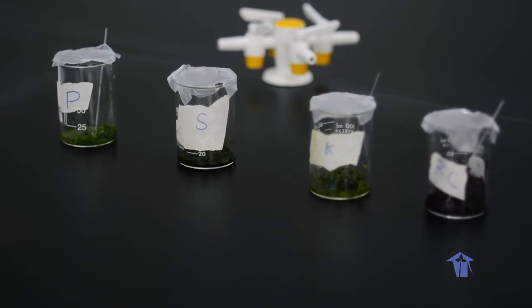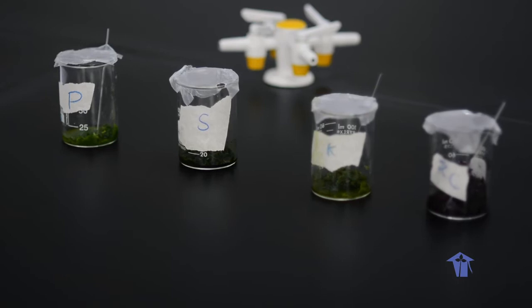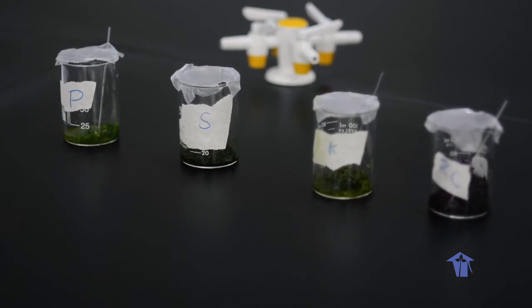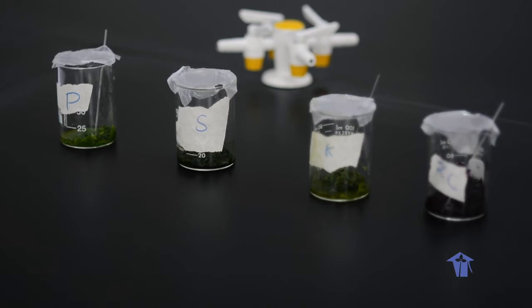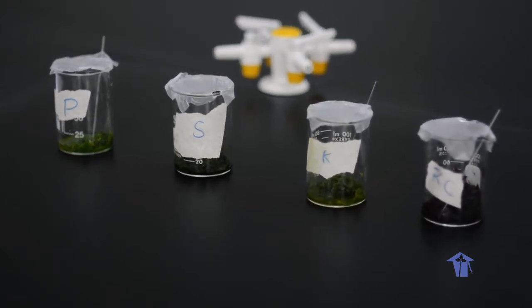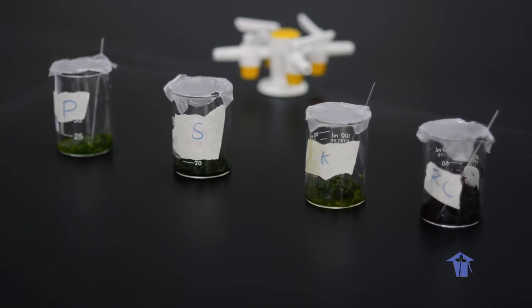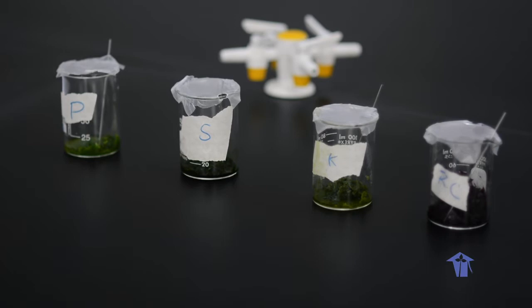Our purpose today is to look at some of the pigments that actually make leaves green. The green that we see on the leaves may not necessarily be only green pigment. In fact, most greens are a combination of different pigments in the plant leaves.